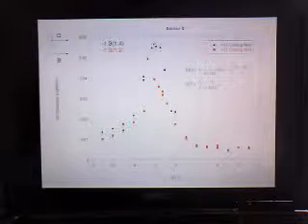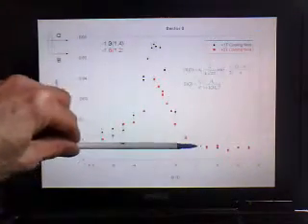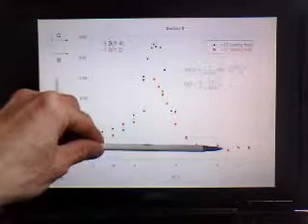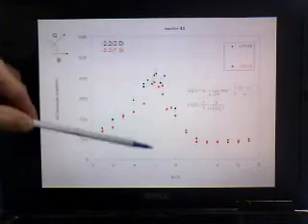how field cooling is affecting this particular amplitude, and it's true also for the Lorentzian for sector 0, that in general the sector 0 data amplitudes are most affected by cooling field. Now the other point I want to make before I go on is if you look here at large applied field, these values of the amplitude for the Gaussian are very small, and that will also be true. They're non-zero, but they are the smallest of all the sector settings. Okay, so now if you just keep watching that as I go to sector 45, you see it did increase a little bit. The amplitude is decreasing at the exchange bias field.